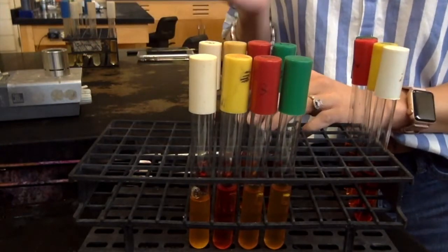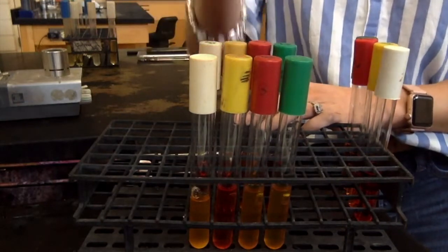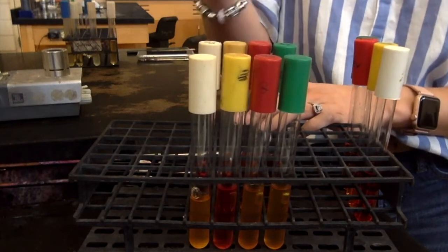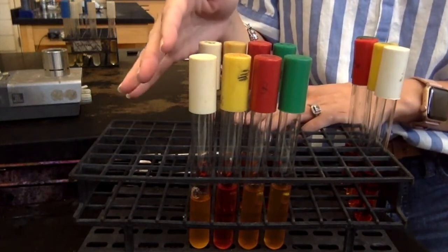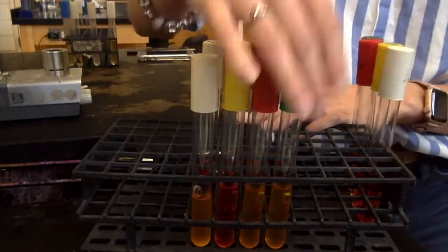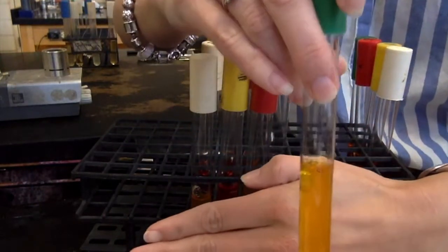Methyl red, remember, a positive result is red and a negative result is yellow. For carb fermentation, it's the opposite for phenol red. Phenol red turns yellow under acidic conditions for a positive result and stays red for a negative result, okay, where no acids were produced.